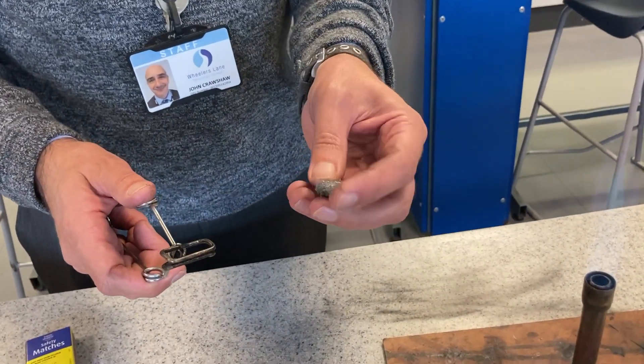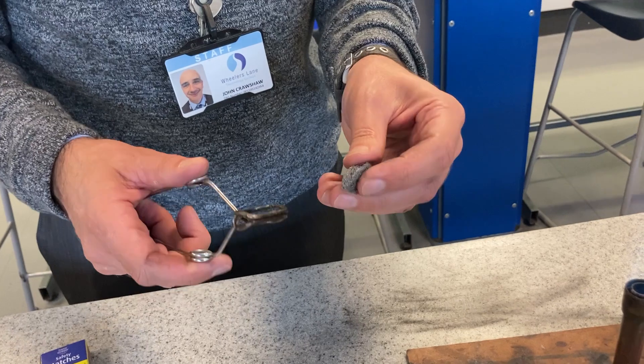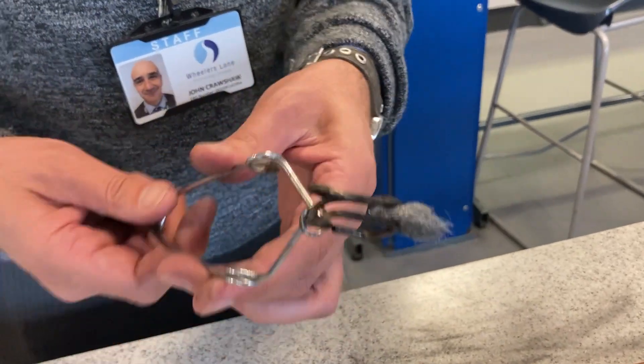Right boys, I'm going to show you what happens when iron goes into a Bunsen burner flame. Now iron is iron and it's going to react with the oxygen.